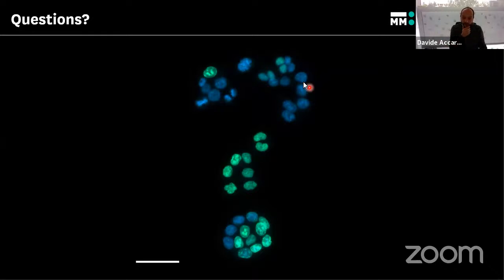Besides the objective lens, there might be optovar lenses that can further magnify the image if needed. Of course, this also implies a smaller field of view. So again it's a compromise; you cannot have it all.